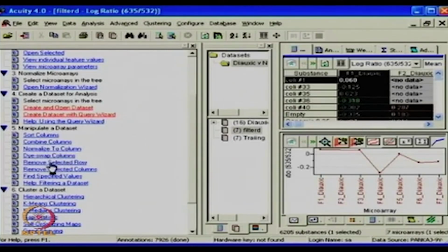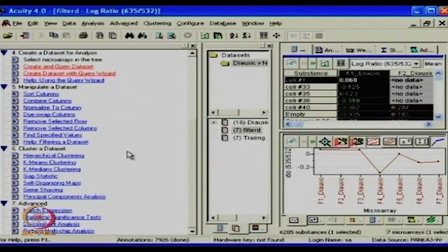And then many times you find that there are a few rows I want to remove. I can remove a few rows, I can select a few of the columns and remove them. Say for example, some QC has not passed. So I can just remove them, which allows me to proceed in different ways. And then once you have done that, you can go and do a clustering, which is a visualization method.